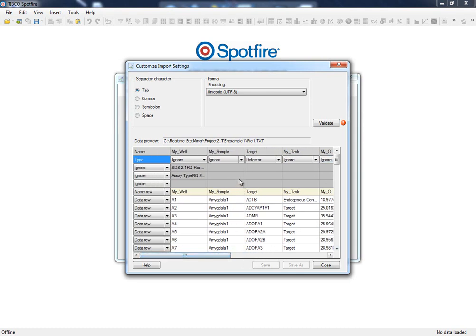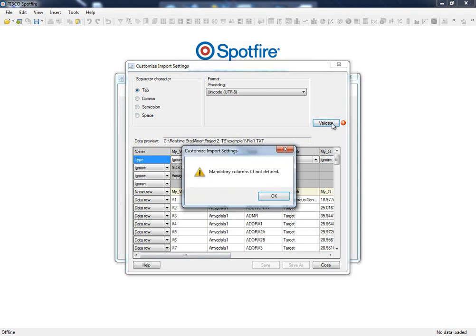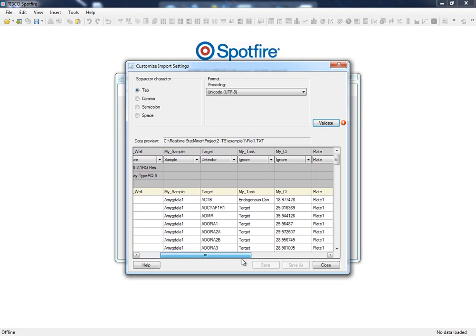In this case, we have to tell StatMiner that this is the column with our sample IDs. The Validate button will let us know at any time if we have provided an invalid column or if there is still information pending that needs to be selected, for instance, the CT values column.